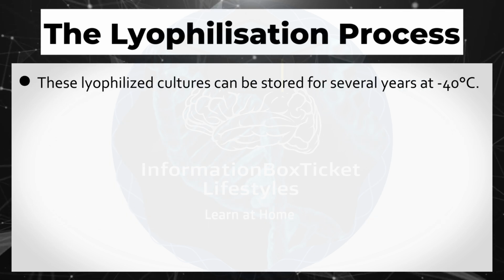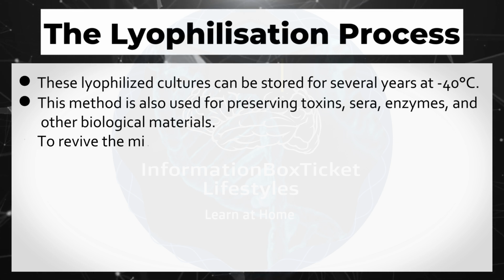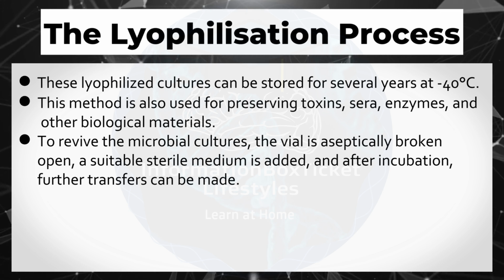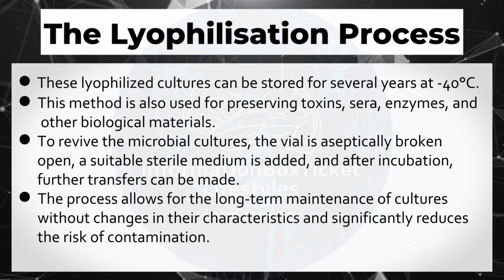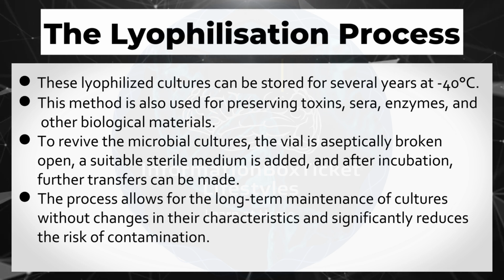These lyophilized cultures can be stored for several years at -40 degrees Celsius. This method is also used for preserving toxins, sera, enzymes, and other biological materials. To revive the microbial cultures, the vial is aseptically broken open, a suitable sterile medium is added, and after incubation, further transfers can be made. The process allows for the long-term maintenance of cultures without changes in their characteristics and significantly reduces the risk of contamination.